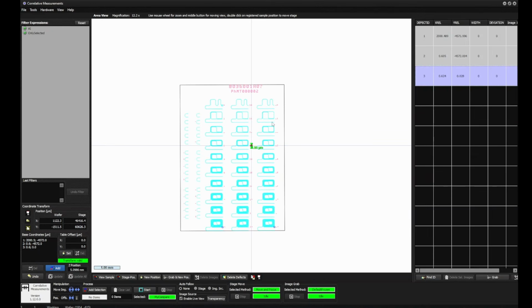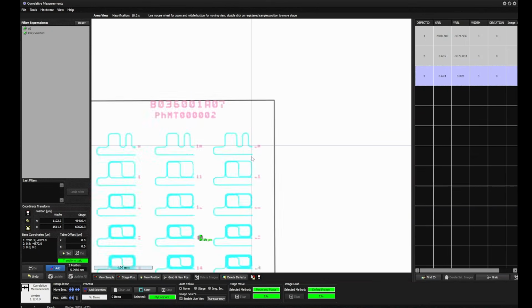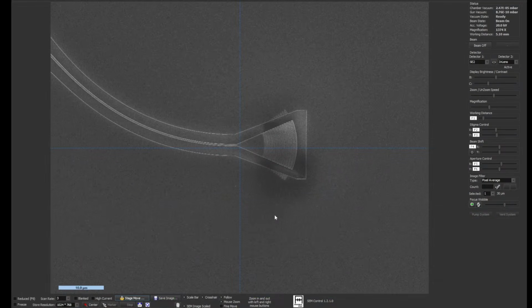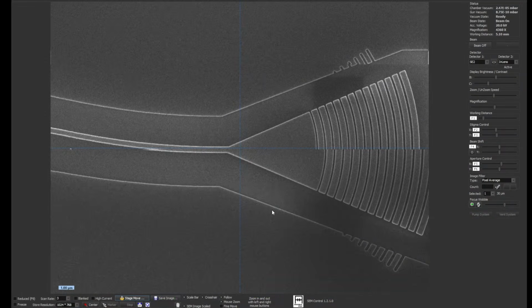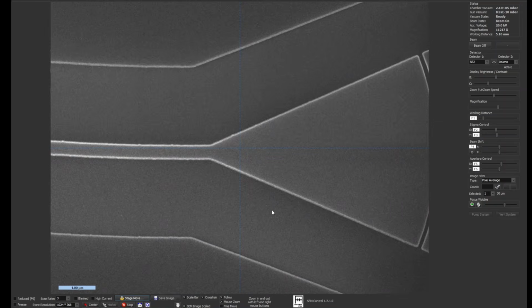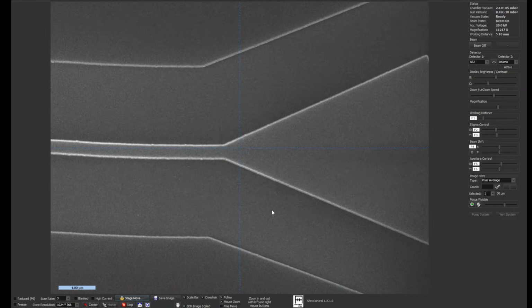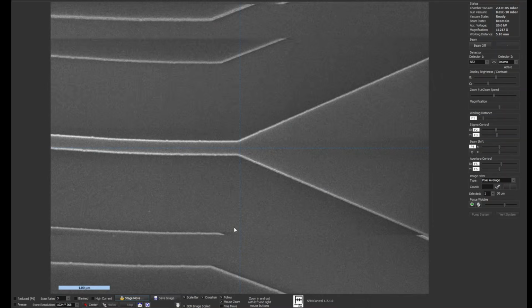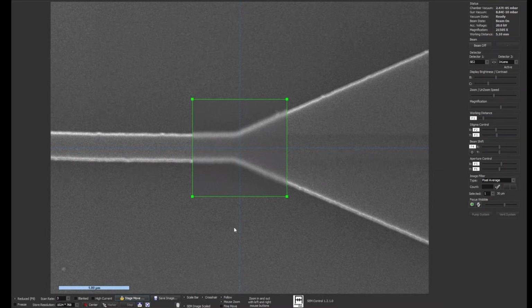on this structure. Maybe I try to add a fourth position. Let's see whether it can improve something. We move here and I go to this. Adding a fourth position will over-define the coordinate system, and then we have 1 point too much, but we can just try whether this helps in getting a better average precision.